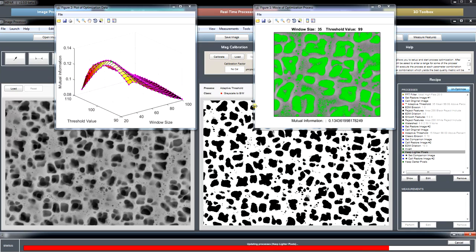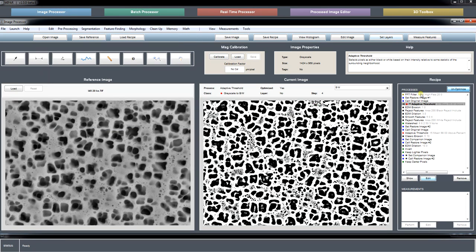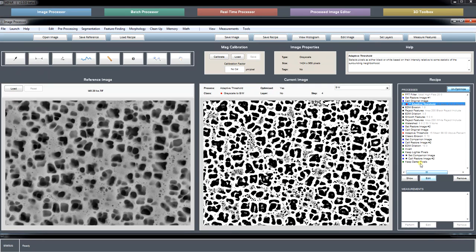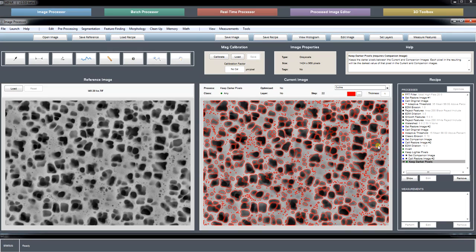So, because in the beginning we knew the parameter combination was likely somewhere in that range, this I would feel much more comfortable using as an objective parameter set after I injected a little bit of my own knowledge by pre-filtering the image so that this was the comparison. And there we have it. So now at the very end, our segmentation looks like this. Of all of the precipitates, we have just our larger ones here and the smaller ones here.